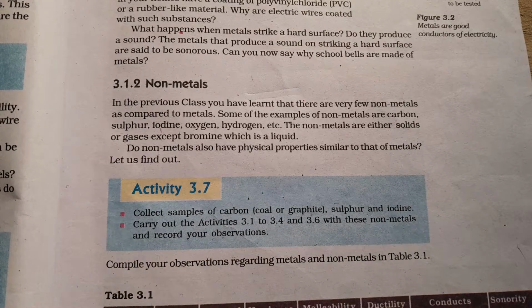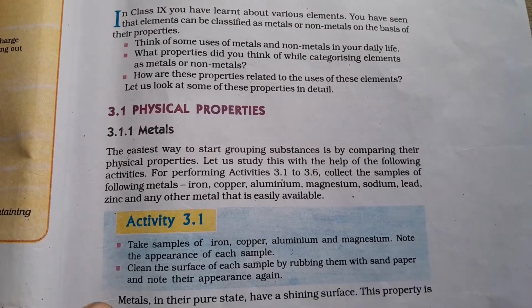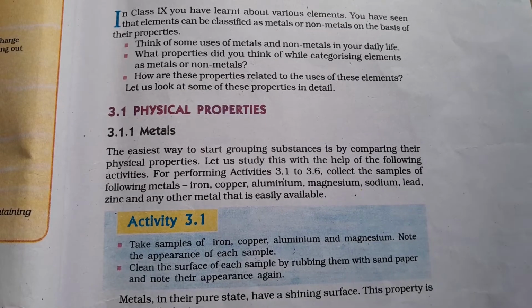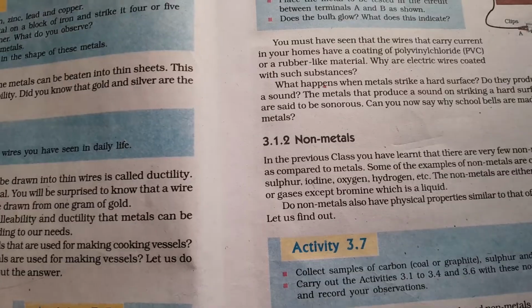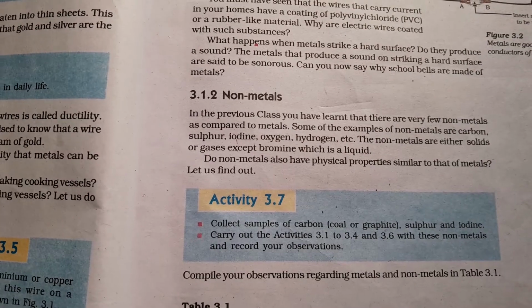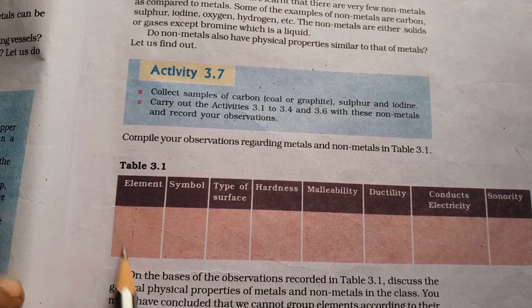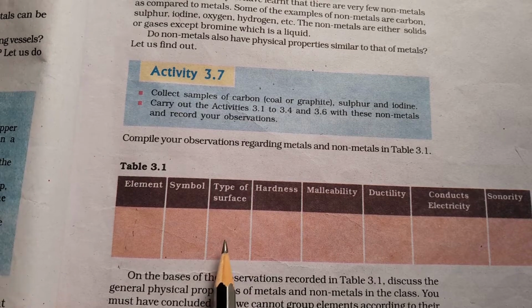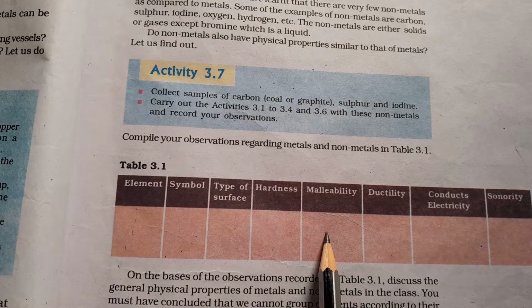What are the activities we have done? So far we have tested the surface of the metals, their hardness, malleability property, ductility property, and conductivity property. So we are going to perform this one. We are going to write the elements coal, graphite, sulfur and iodine, and symbol and type of surface, whether it is lustrous or not, and hardness, whether it is hard or not. Malleability means it can be beaten into sheets or not.